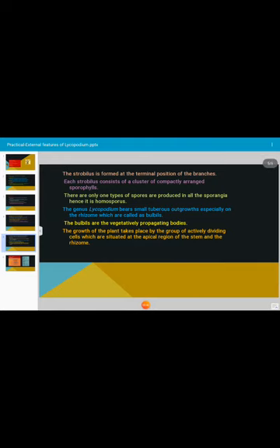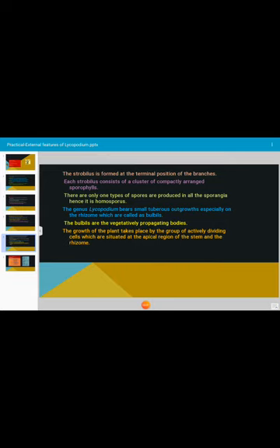The strobilus is formed at the terminal position of the branches. Strobilus is also known as cone. Each strobilus consists of a cluster of compactly arranged sporophylls. There is only one type of spores produced in all sporangia. Hence, Lycopodium is homosporous.